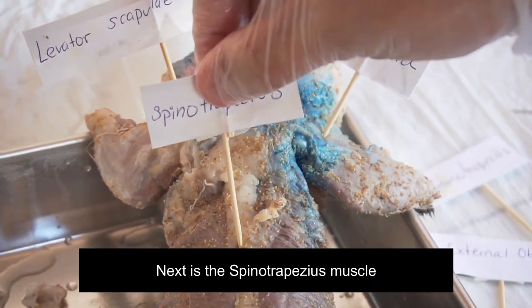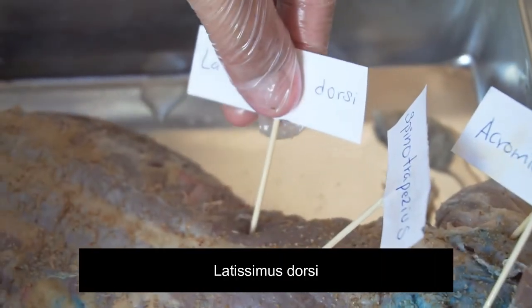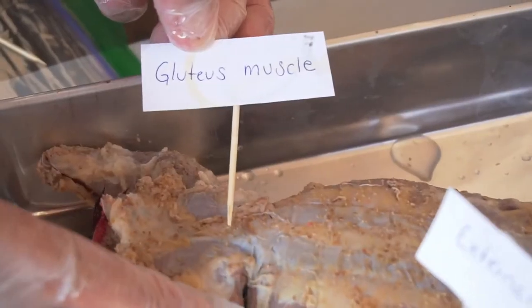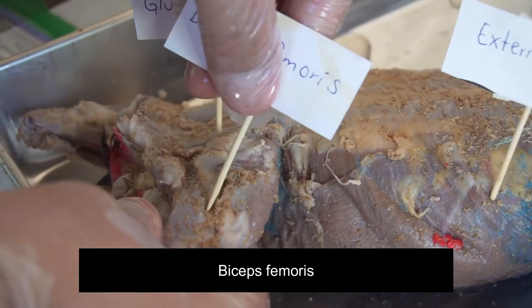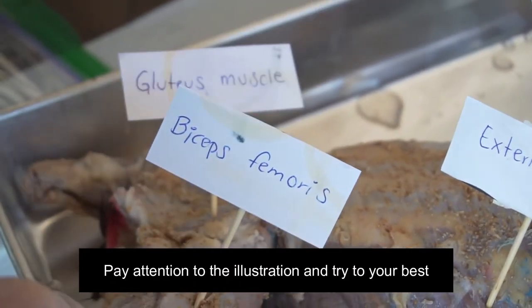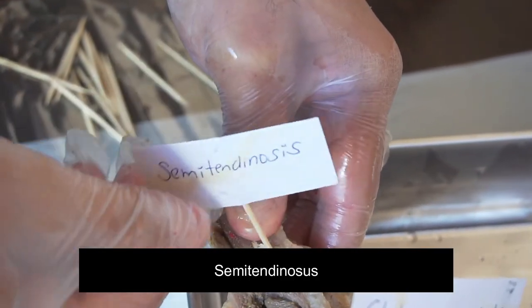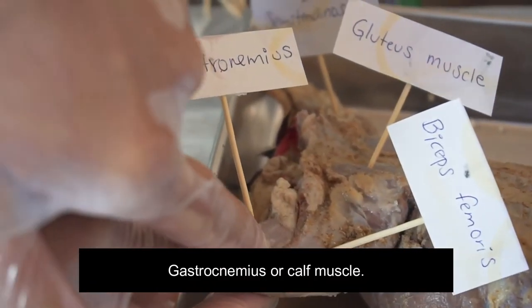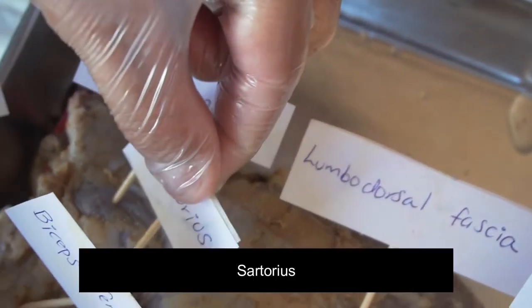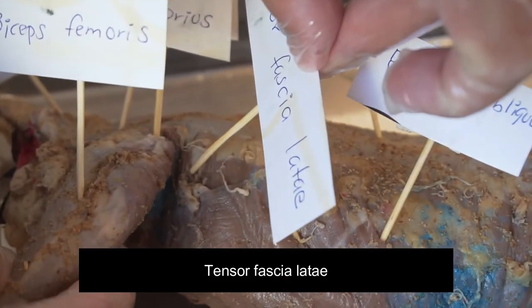Next, the spinal trapezius muscle, acromio-trapezius, latissimus dorsi, external oblique, gluteus muscle, bicep femoris. Pay attention to the illustration and try to do your best — have fun and enjoy the activity. Semitendinosus. Gastrocnemius, or calf muscle. Lumbodorsal fascia. Sartorius. Spinal deltoid. Tensor fascia lata.